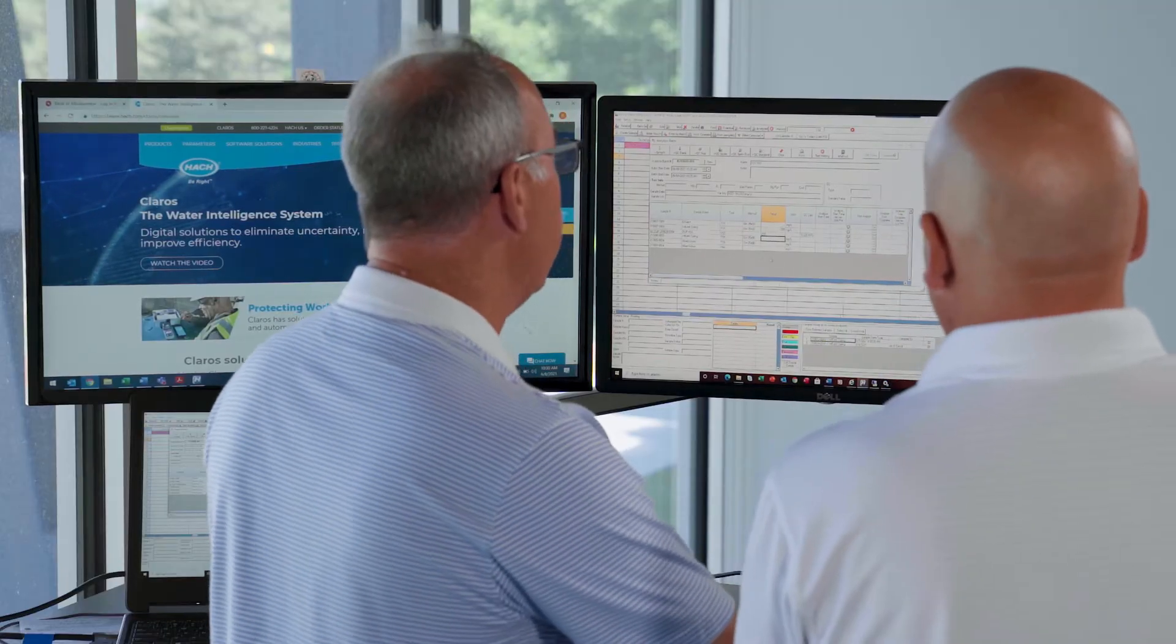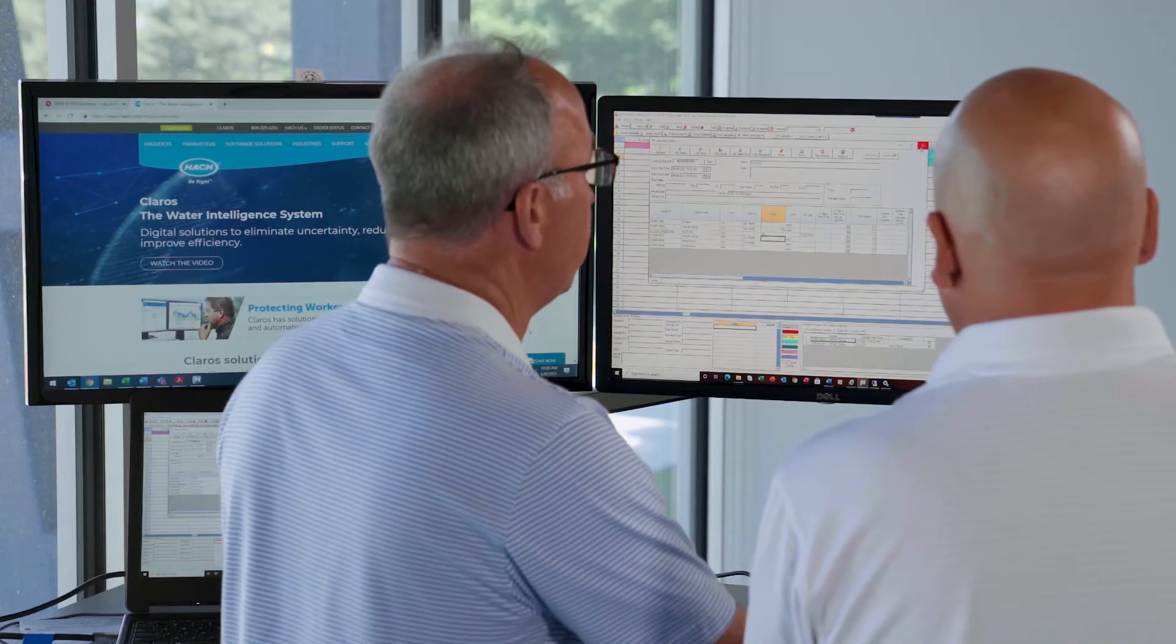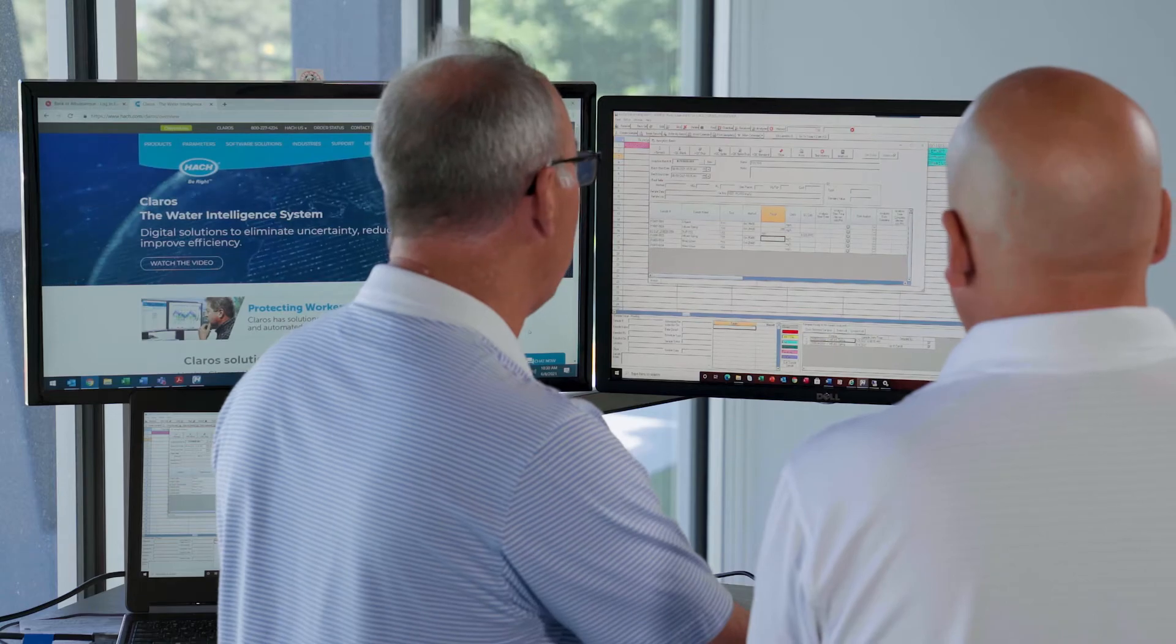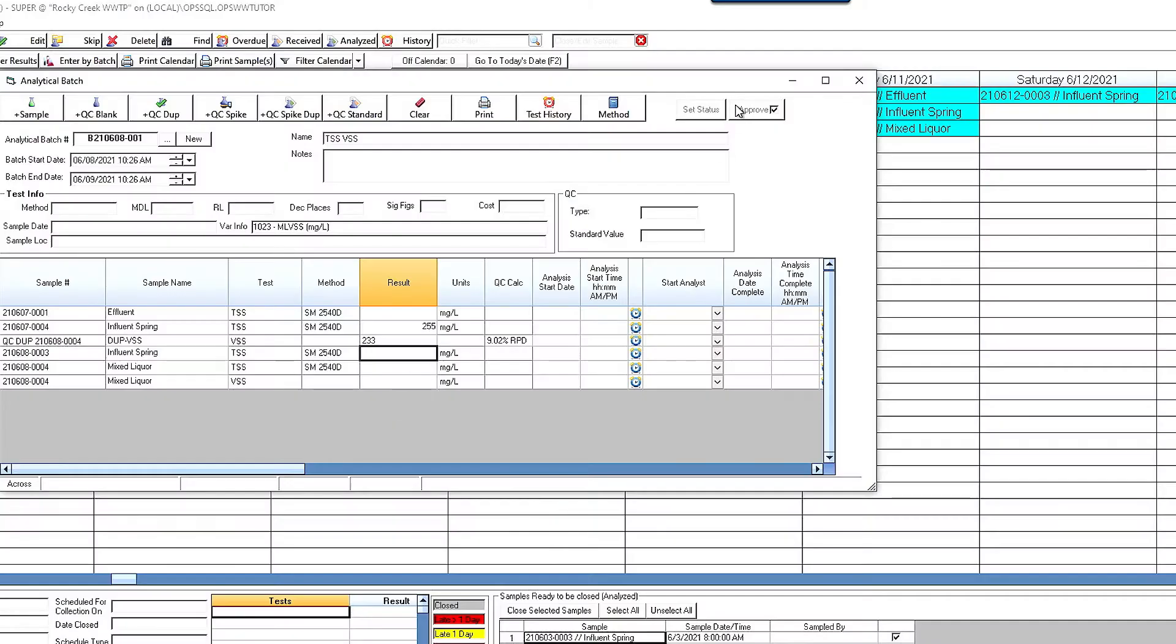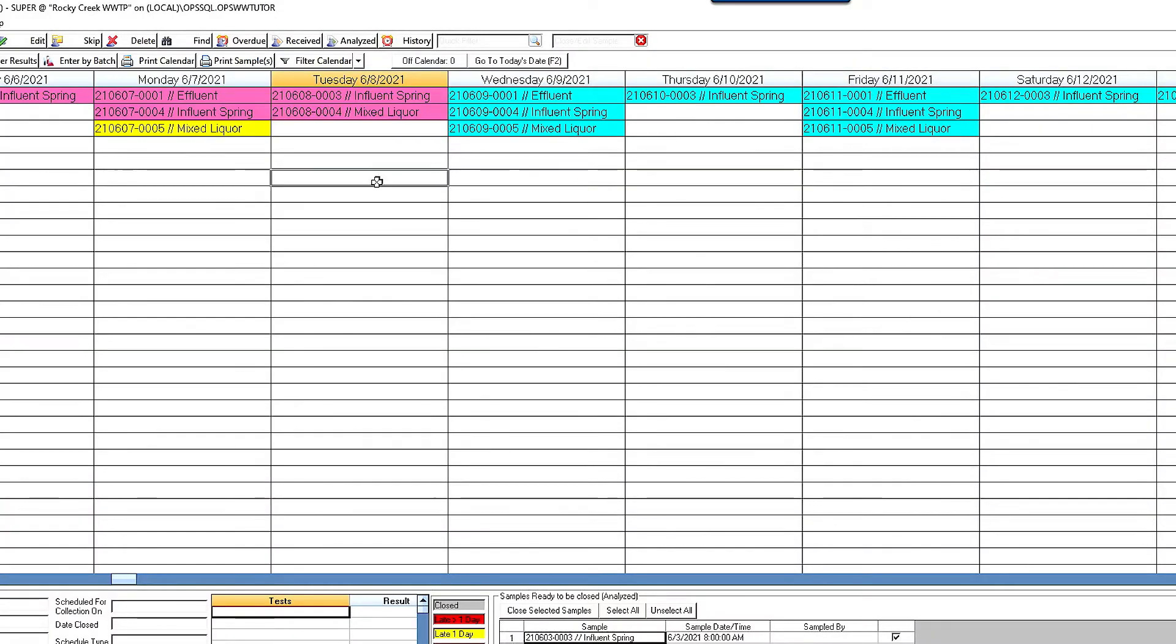So once I enter in my data, I simply save that and those results, as you know, go into the WIMS database. Beautiful.